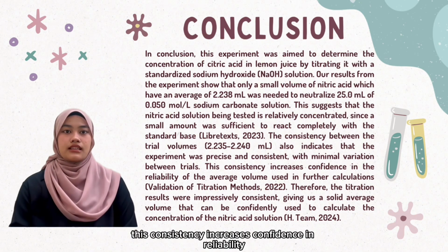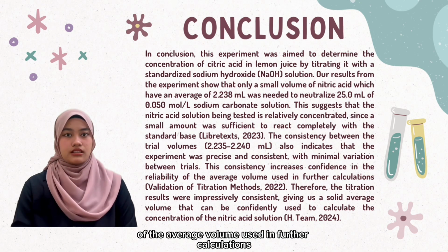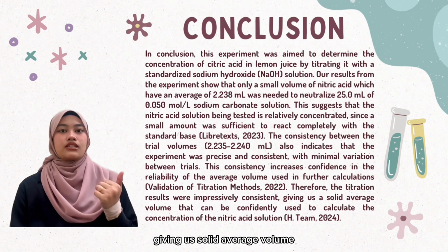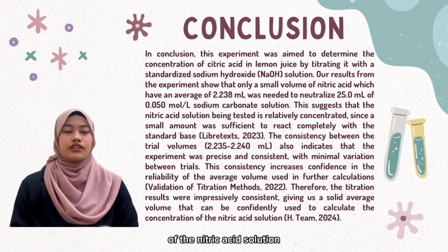This consistency increases confidence in the reliability of the average volume used in further calculations. Therefore, the titration results were impressively consistent, giving us a solid average volume that can be confidently used to calculate the concentration of the nitric acid solution.